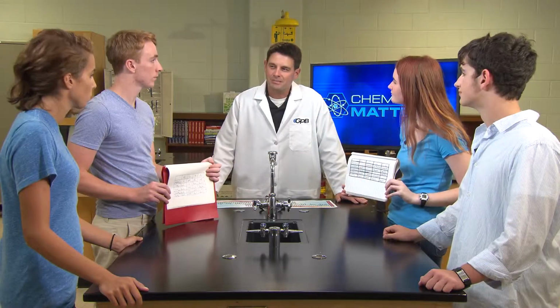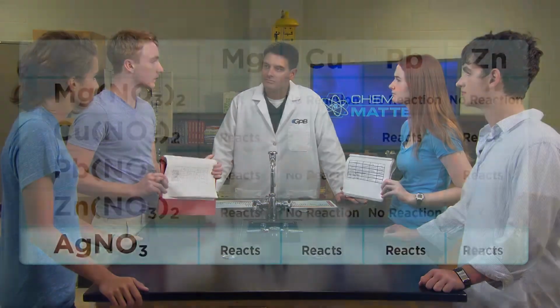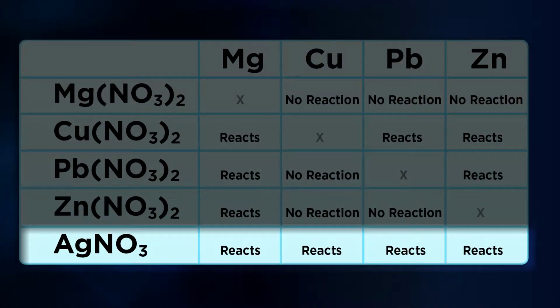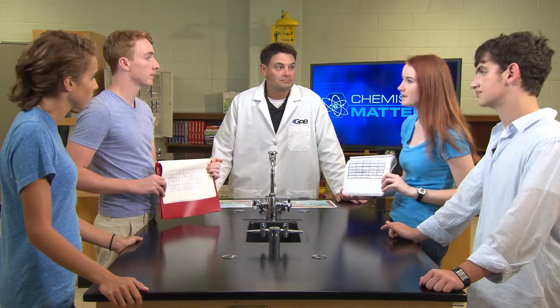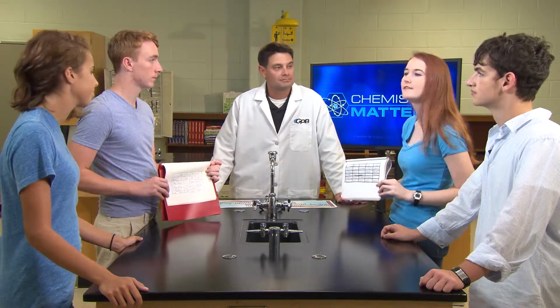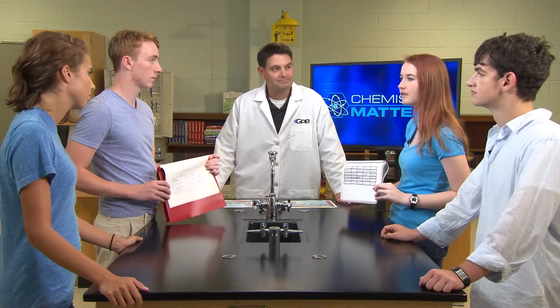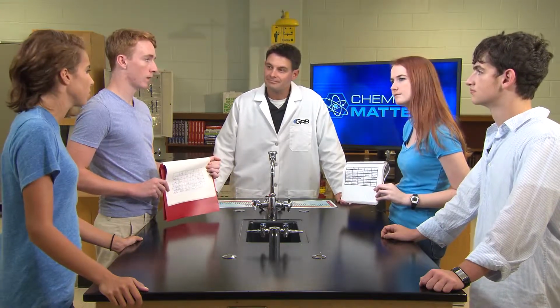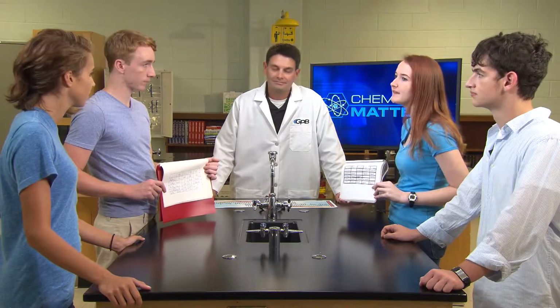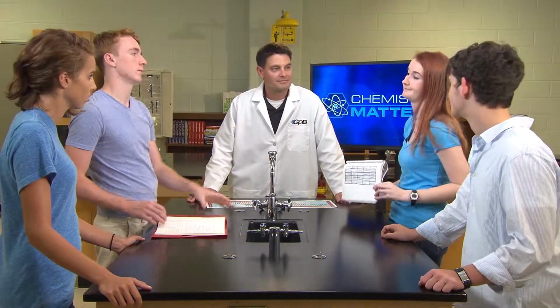So if you had a sample of silver, what do you think it would have reacted with? Since it looks like the silver solution reacted with everything, I think the silver metal would too. But the magnesium metal reacted with everything, while the magnesium nitrate solution didn't. I think the silver metal wouldn't have reacted with anything since the silver solution reacted with everything. I don't think the silver would have reacted either. That makes sense to me. I mean, I wear a silver bracelet and I've never seen it react with anything.